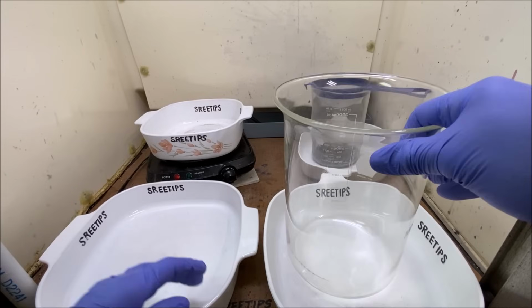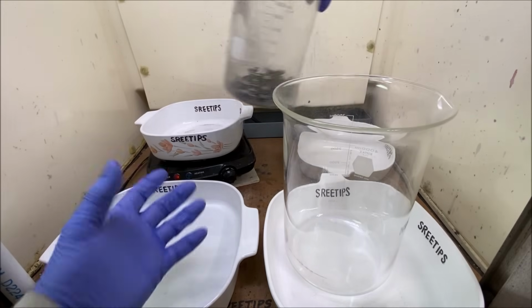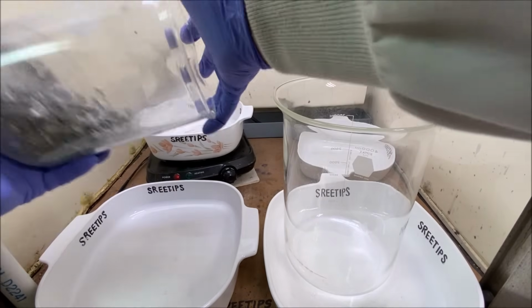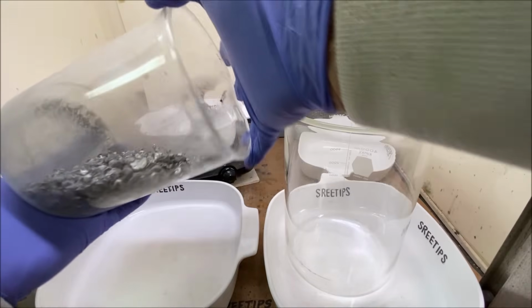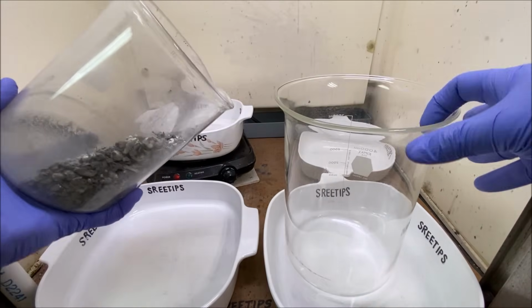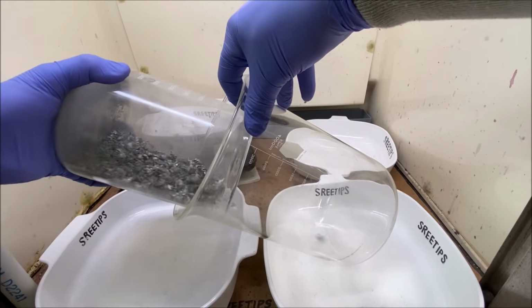Alright, let's go ahead and transfer these pieces of silver into a larger beaker. This is all the cement silver that I rinsed off. I was going to run it back through the silver cell, but I don't think that's a good idea. I shouldn't have done that. I'm going to transfer it into this larger beaker.